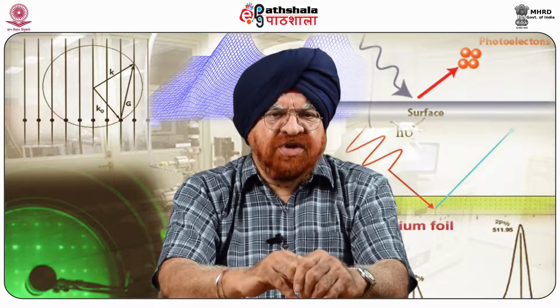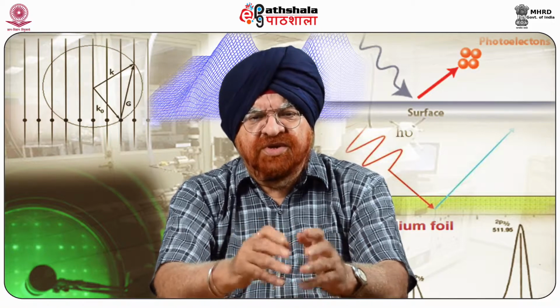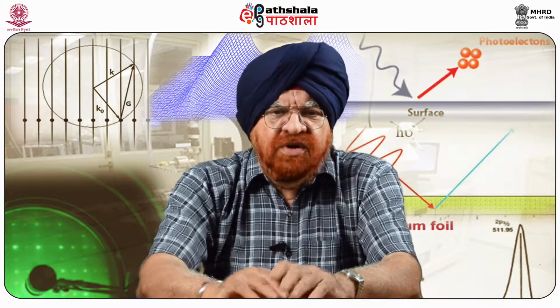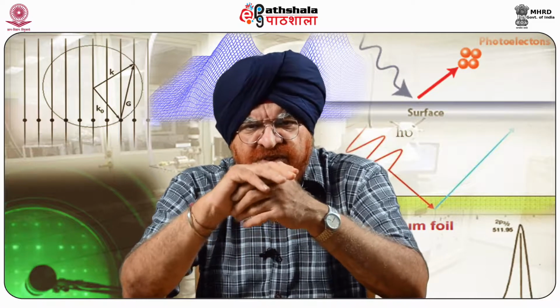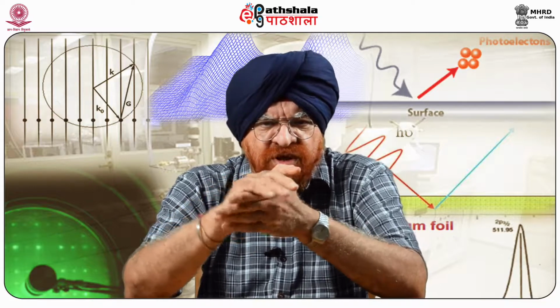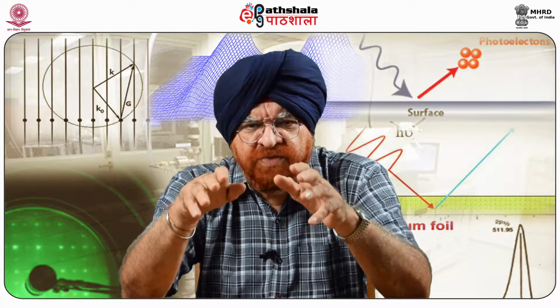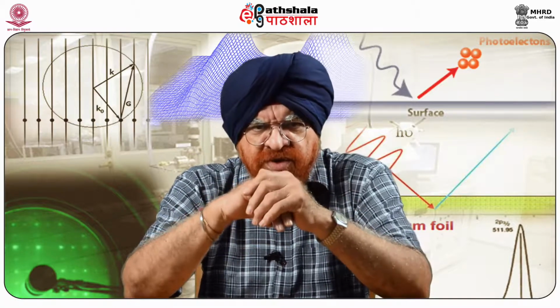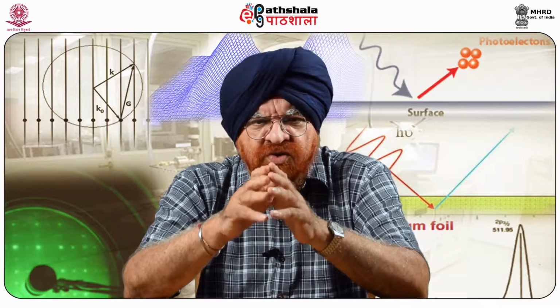Now, chemical force imaging can be done with the help of chemical sensing or chemically sensitive imaging. AFM probe tips are covered by particular chemical functional groups. We have given the examples of methyl, NH2 or COOH, and more exotic biological molecules have been studied too, scanned over a sample to detect differences between the species on the tip and those on the surface of the sample. Chemical imaging of structures present on the surface, due to differences in interactions between the tip and the sample, can be studied.